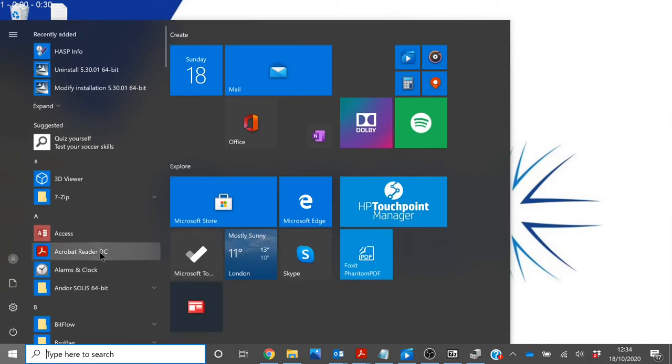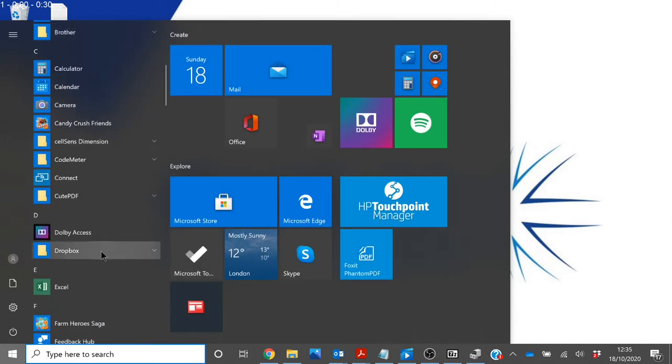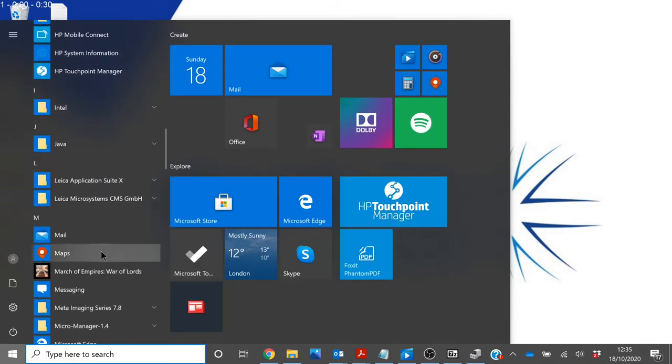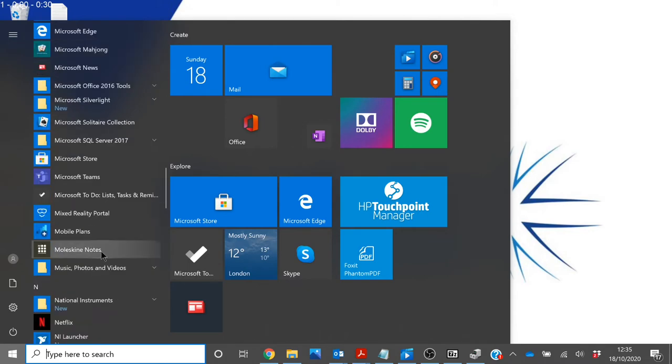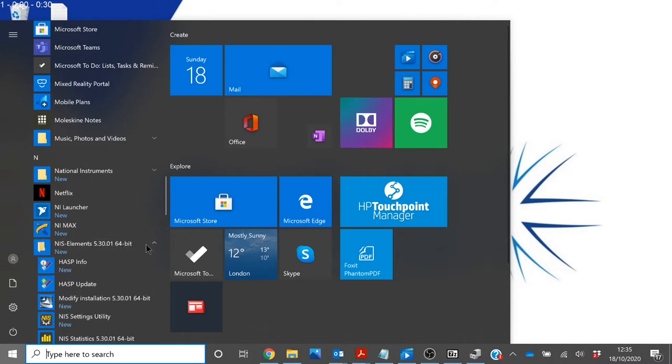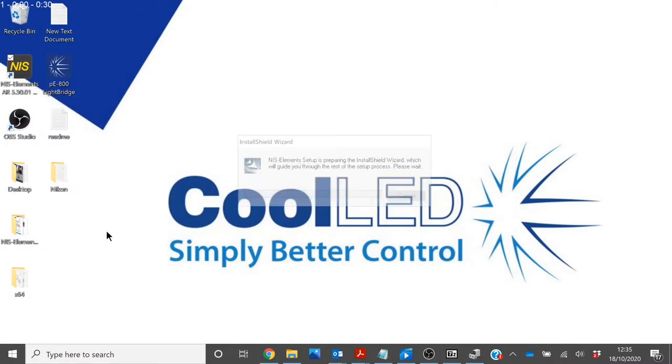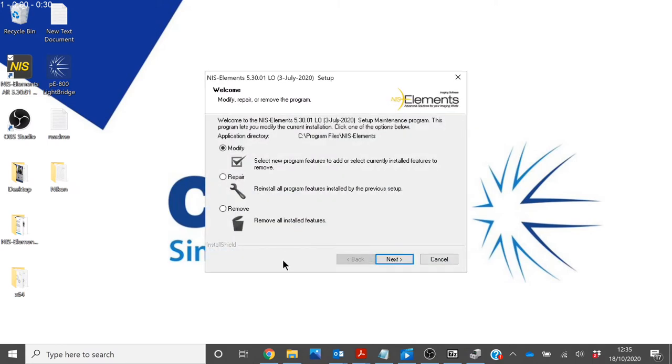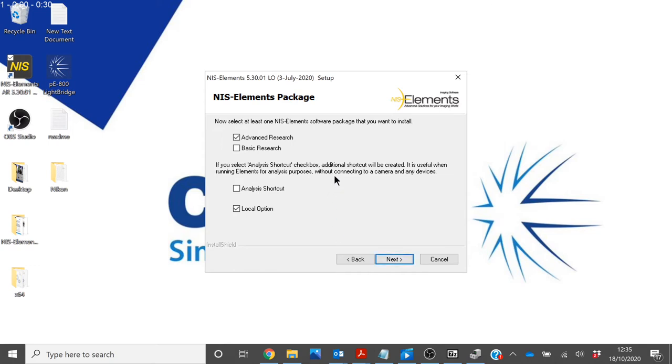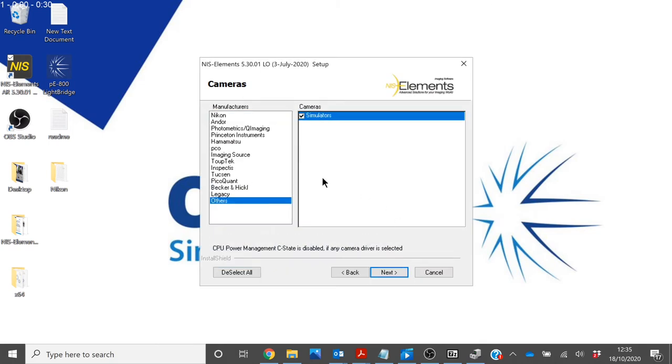We will then need to modify the installation of NIS Elements in order to add in the PE800. In order to do this, go down to NIS Elements and select modify installation. Ensure modify is selected, and then run through this setup dialog. For this setup we are using a demonstration camera, so simulators is selected.